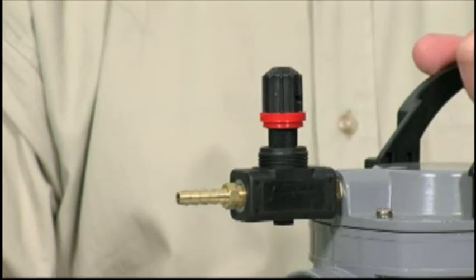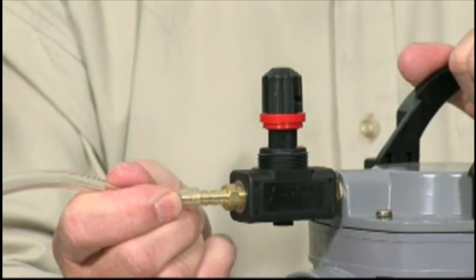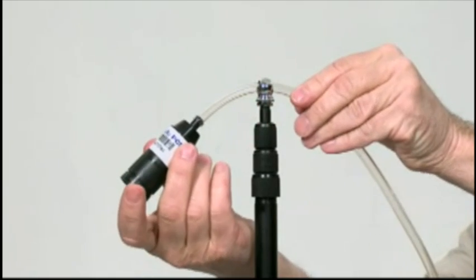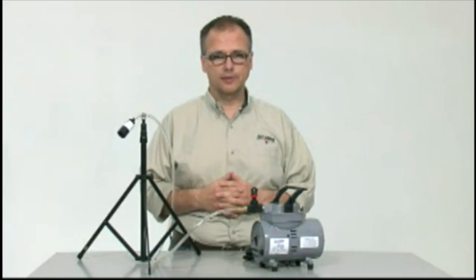To set up, just add five feet of tubing to the inlet of the regulator. Then attach the other end of the tubing to a cassette. That's it, you're set up and ready to draw samples.